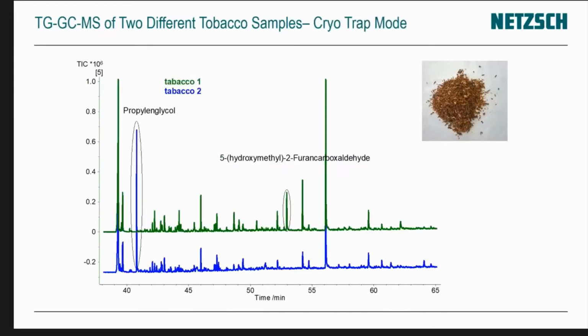Here we take advantage of the GC-MS cryotrap method. The released gases were sampled in short intervals on the cryotrap at -50 degrees C and condensed there. Only after the end of the TG measurement, the cryotrap is heated and the evolved gases were separated on the GC column.